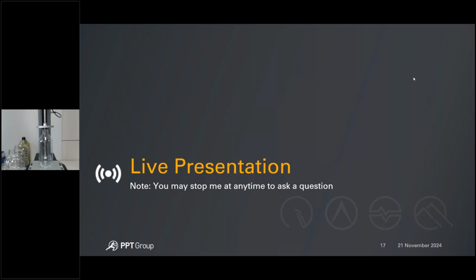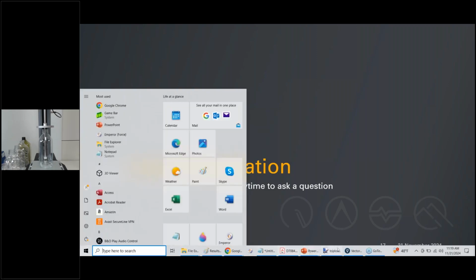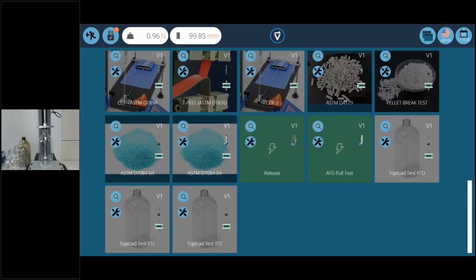In that process, we'll run 2 tests where we're compressing to a known displacement, measuring the peak load, a couple more tests where we're applying a specific force and then measuring the deflection, and then that final test where we're compressing until the sample fails to see where the sample actually fails. So the deflection at failure and then the maximum force at failure. So those are the types of tests that we're going to run today. I would also like to share the software screen so you can see what this test looks like.